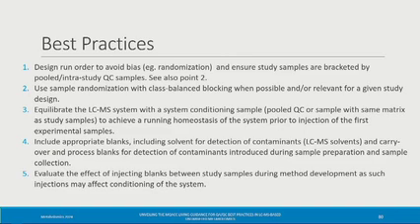And we decided for the second one because we have more data on the system suitability to track relative standard deviation or whatever you need to track. So I want to know if there is any recommendation on that and what is your practice, let's say, at your lab. So just to clarify, you're saying basically you'd run your system suitability test with one column and then you'd change the column to run the rest of it? Exactly. So in the end, you don't have any information on the performance of the column you're running at the moment. We just rely on the pressure.